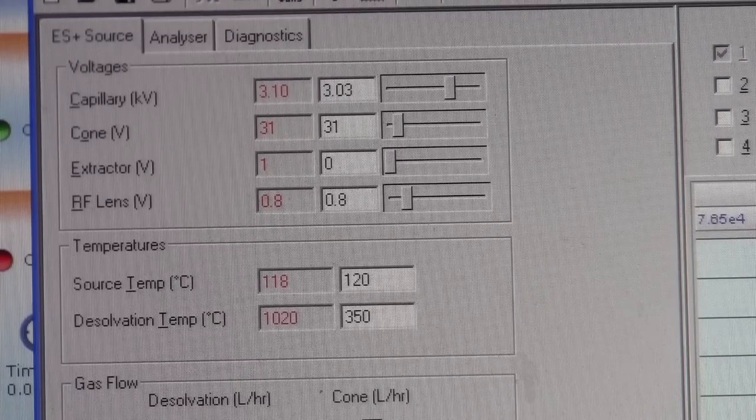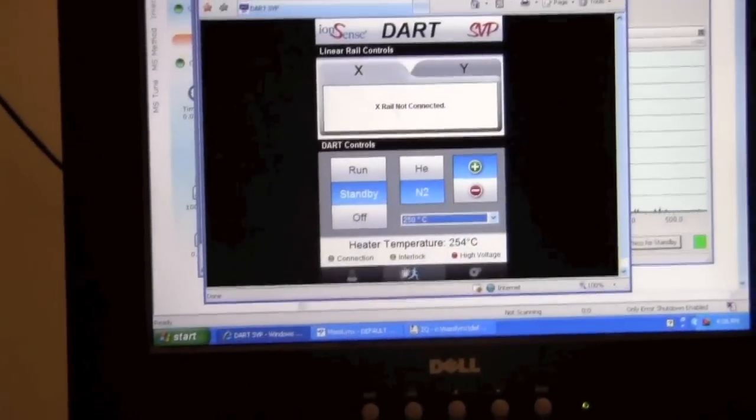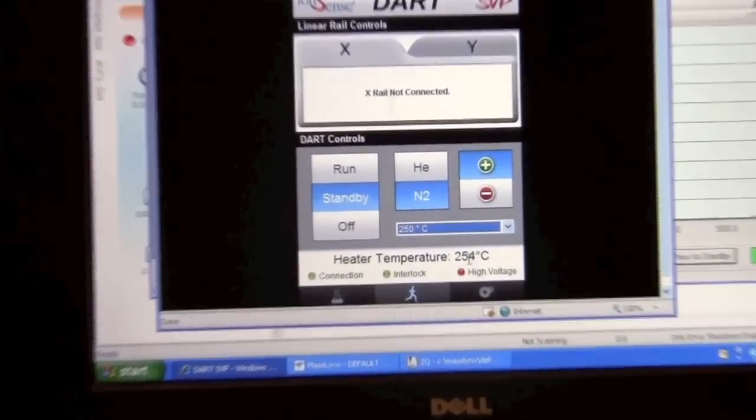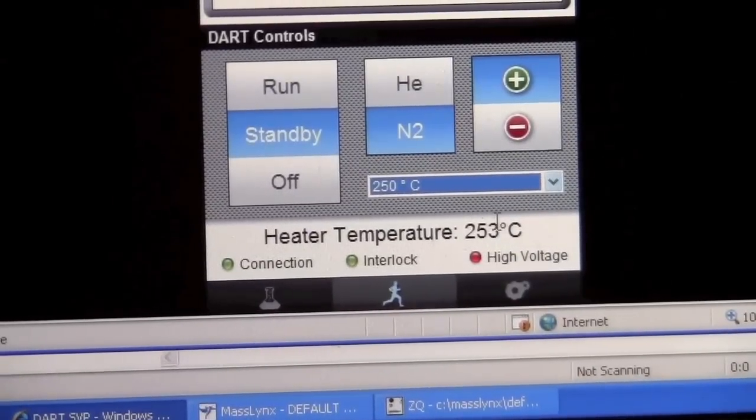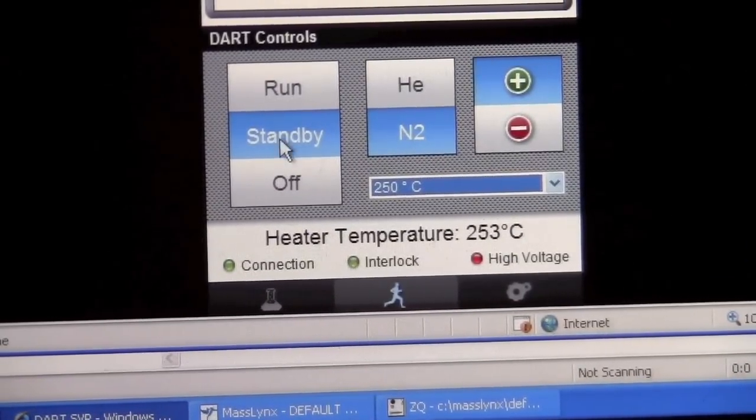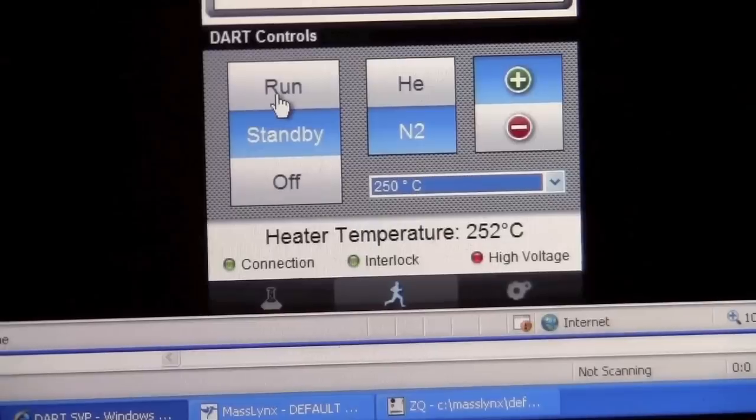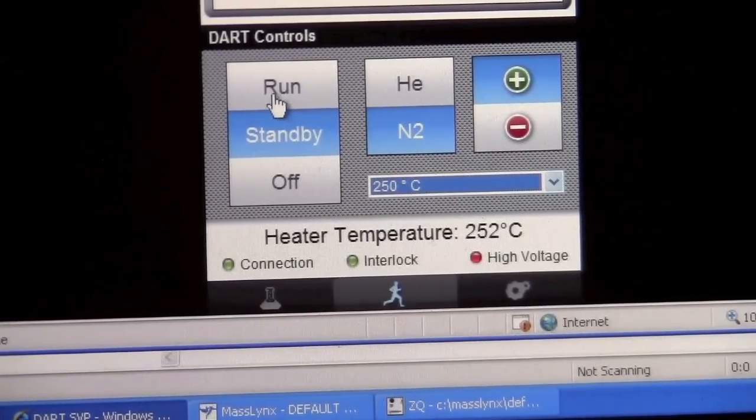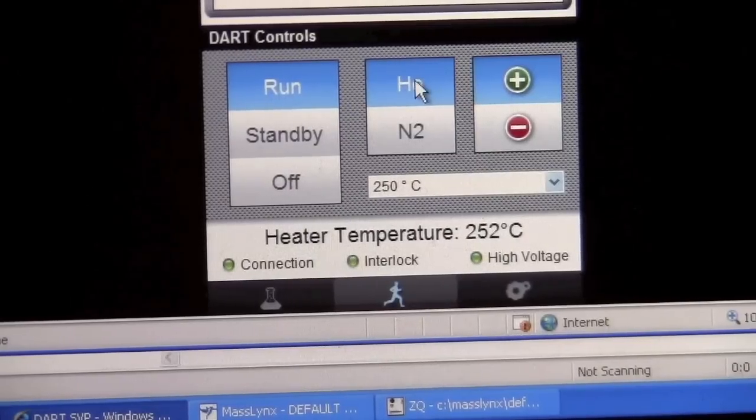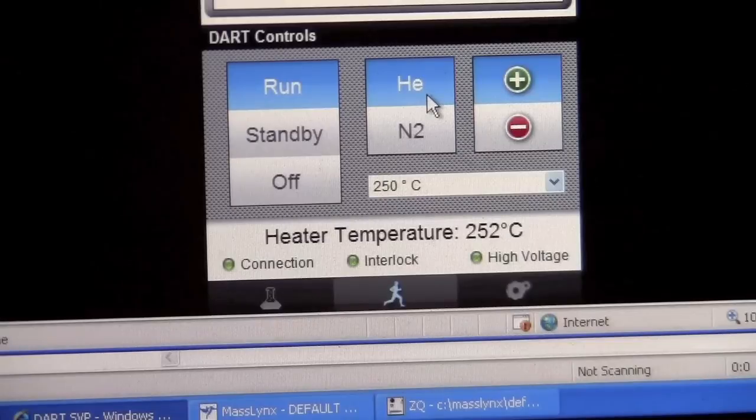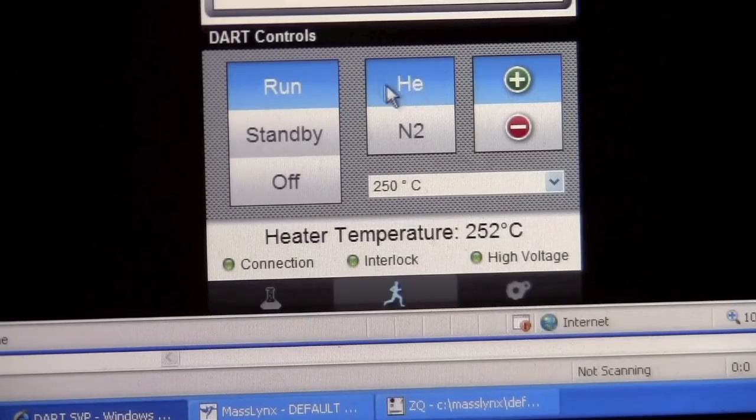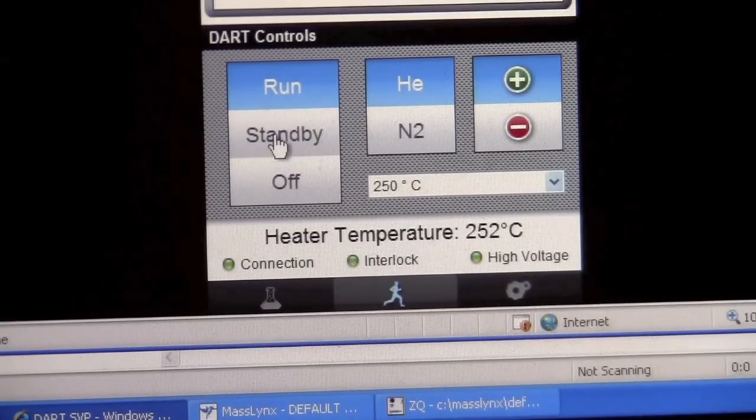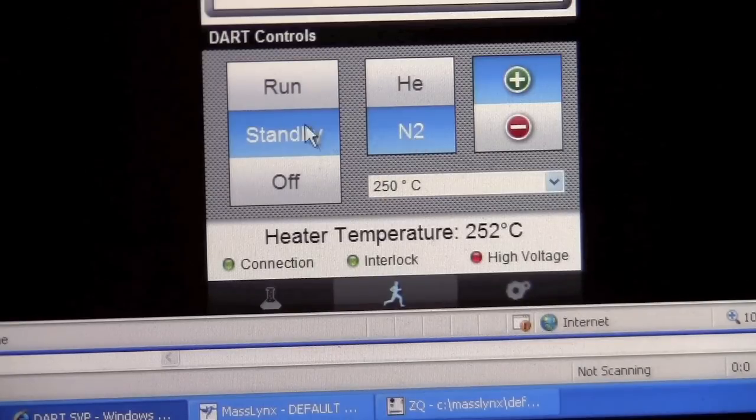Let's go back to the dart source and see how it's doing. The temperature has now reached our target temperature of about 250 degrees C. We can switch the mode into run. When I switch it into run it's going to change the gas from nitrogen to helium. We only want to leave it in run mode for a limited amount of time because it uses helium and we do not want to use too much helium. So when you're done running be sure to put it back in standby mode so we are only using nitrogen.